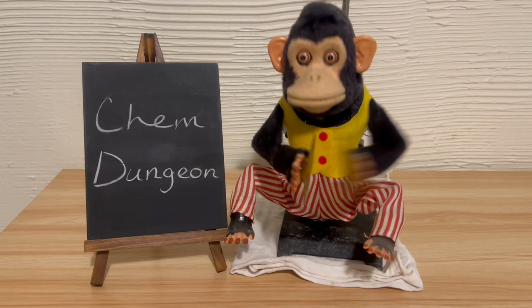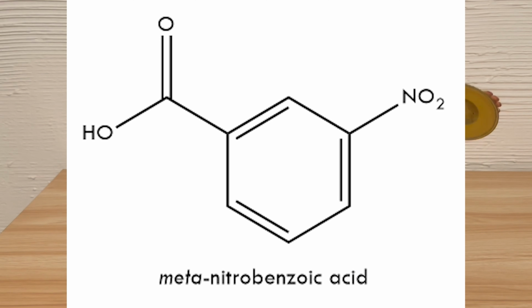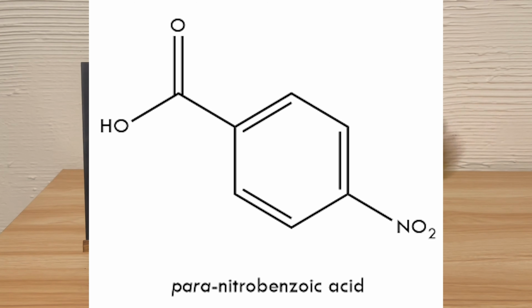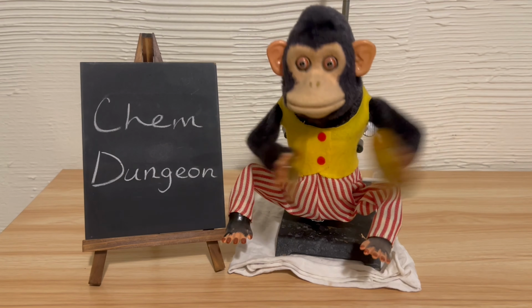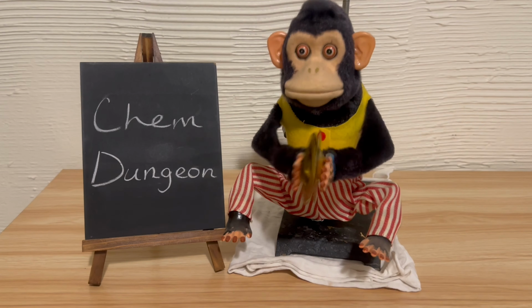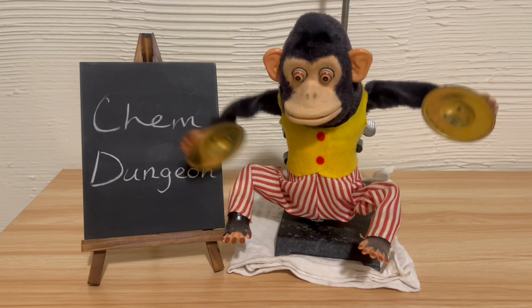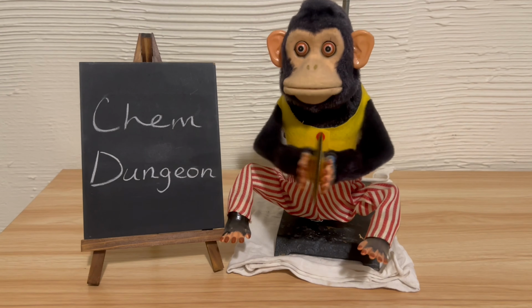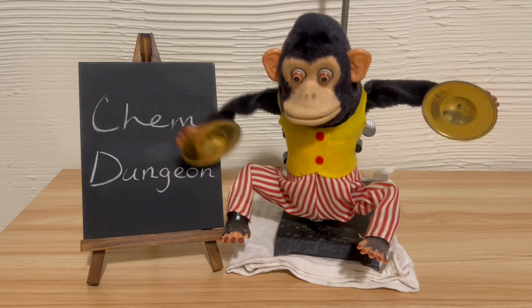Nitrobenzoic acids readily decarboxylate at fairly low temperatures, the meta-isomer at 238 degrees, the ortho-isomer at 180 degrees, and the para-isomer somewhere above 240 degrees. The para-isomer actually sublimates before it can decompose, so it's good that very little is produced in this reaction. These temperatures are easily achievable in an ordinary glass distillation setup, so I think this is a viable route to nitrobenzene, starting from the very cheap sodium benzoate.